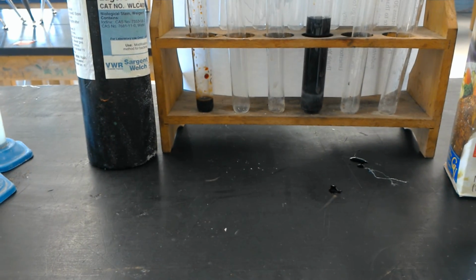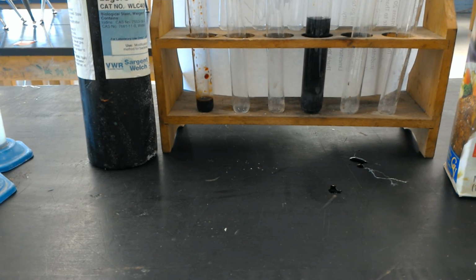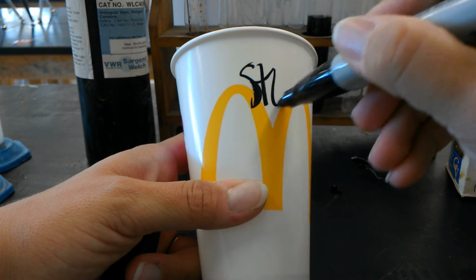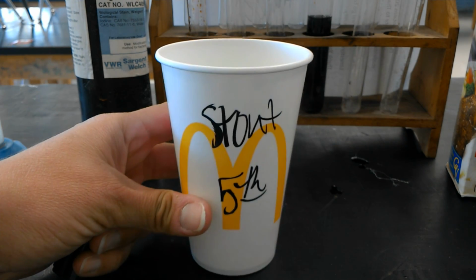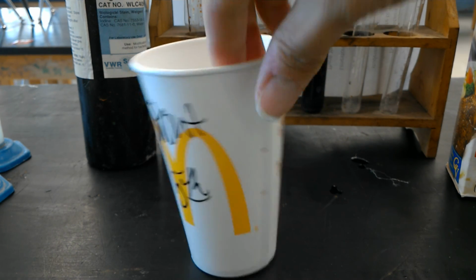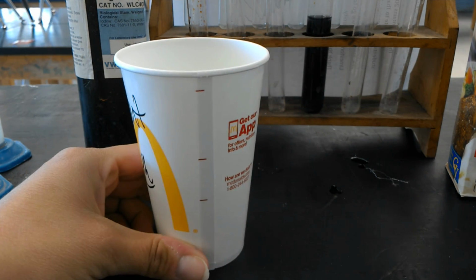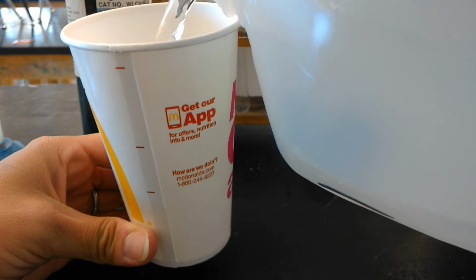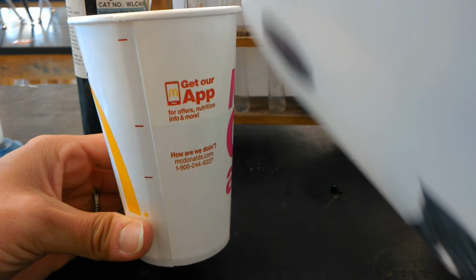So when you are getting started, what you will need to do is take a clean McDonald's cup, I know, super fancy, and before you put anything in there, I want you to put your name on it. So, putting my name on it, and hour. Don't put 5th, because no one's in my 5th hour class. Put the hour that you are in. In the McDonald's cup, to about the second red line, you are just going to take water from the jug that will be at the main lab table, and you'll fill it to about that second line.